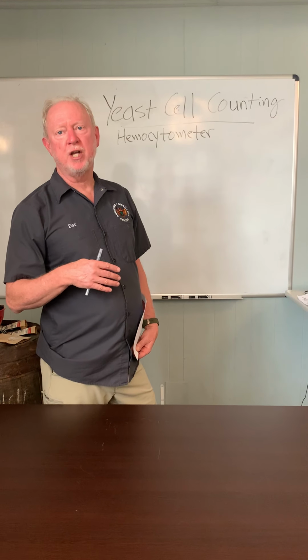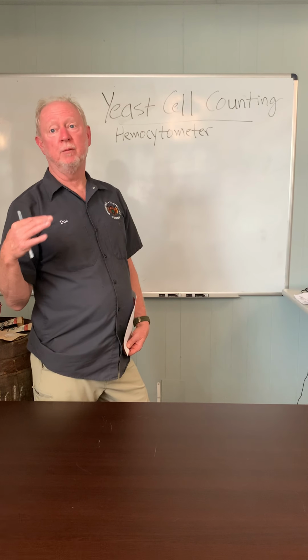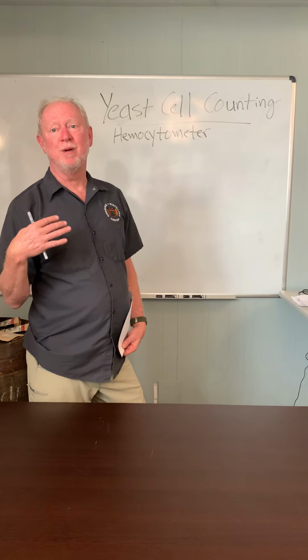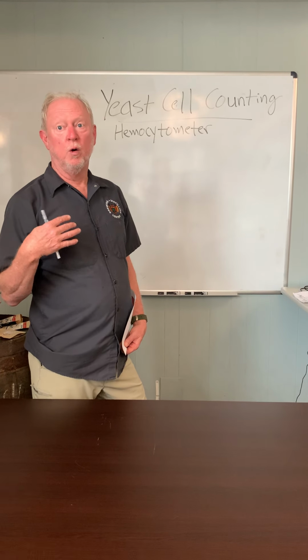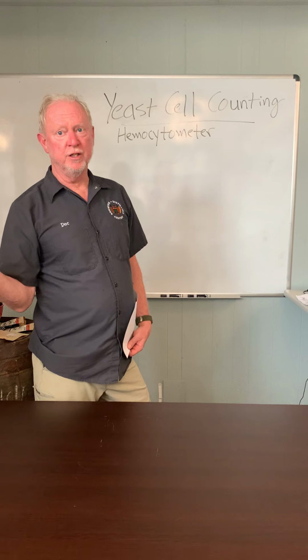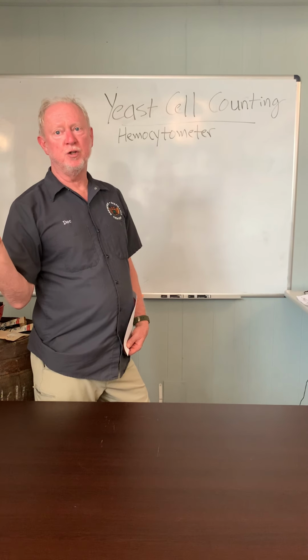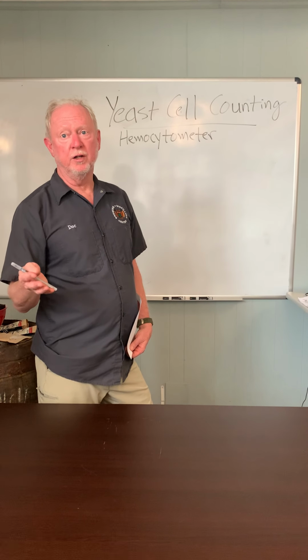But let's chat just for a second about yeast cell counting, the skill that you have to know how to do, which is one of the main reasons we're teaching you how to use a microscope. It's an extremely important skill, one, to be able to use a microscope, and then two, identify the yeast cells and count those and figure out, using this easy formula, how many yeast cells you have. Do you have enough for your beer to make a good quality beer?